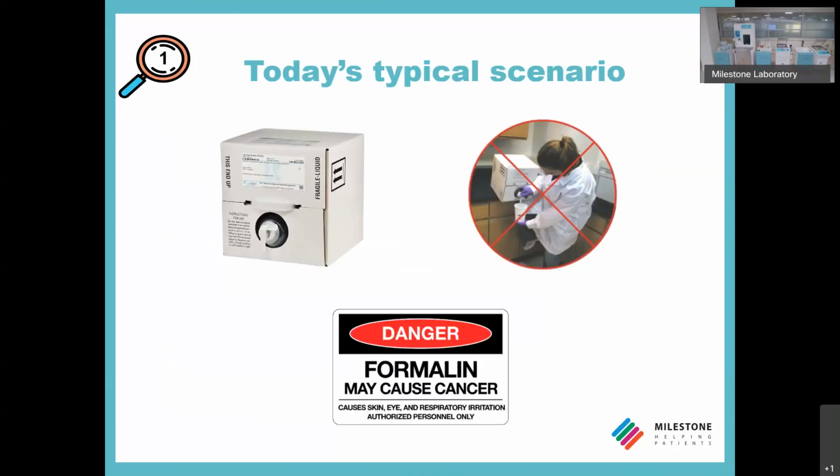So in a situation like this one, see in the circle, where a nurse in the nearby dirty room in the operating room center manually dispenses and pours formalin from a container into a plastic bucket where the biospecimen is present, this is not possible anymore.